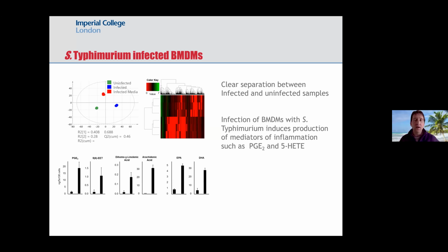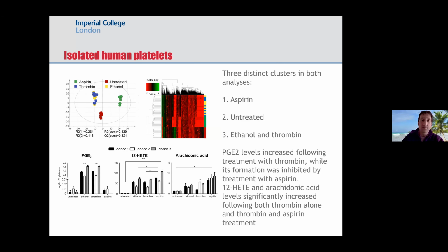So this shows you the salmonella infected macrophages here. It's an N of 4, I think, in terms of replication here, and the PCA analysis is rather overkill, so everything ends up dotted on top of each other. But we can nicely detect a range of different lipid species and identify them by matching the CCS values along with their retention times and also their exact masses, and confirm that with our fragmentation data that we'd also collected on the standards.